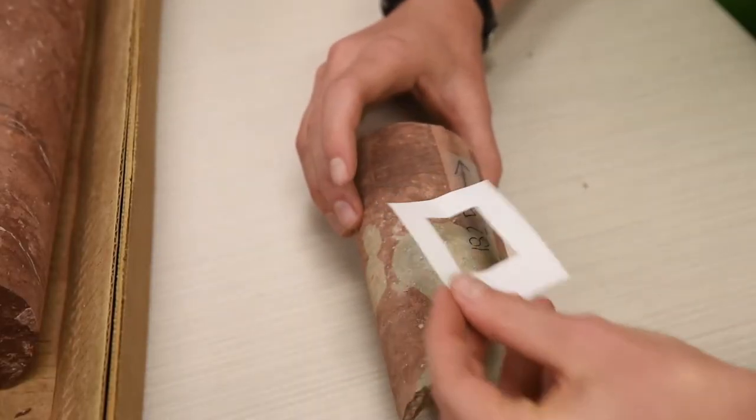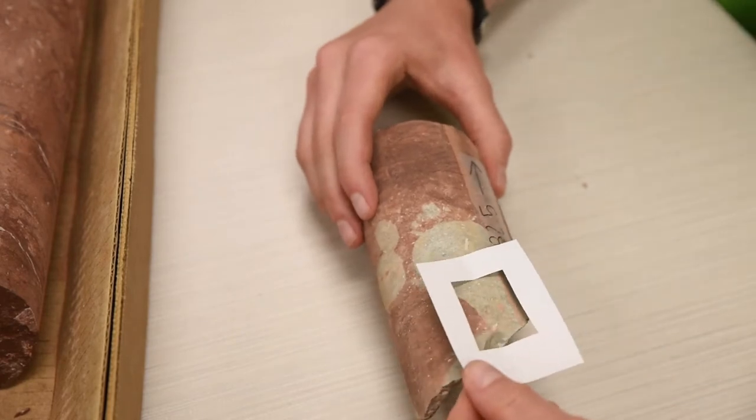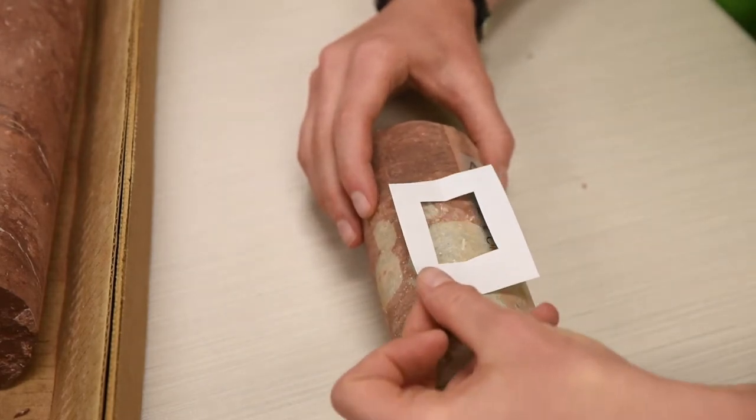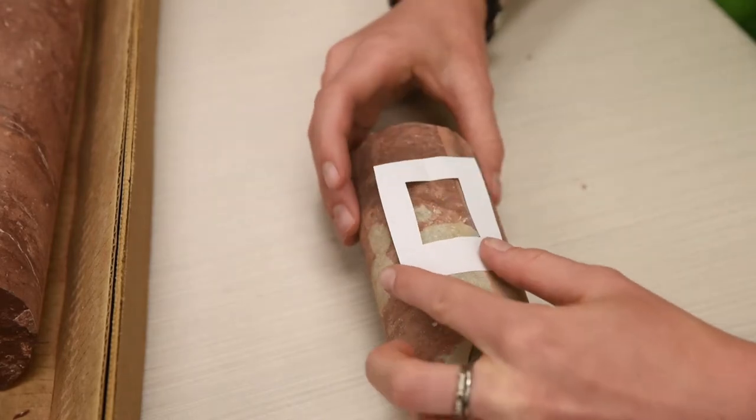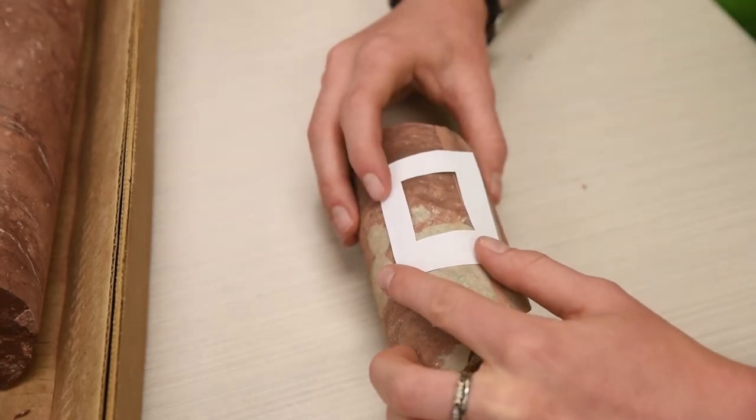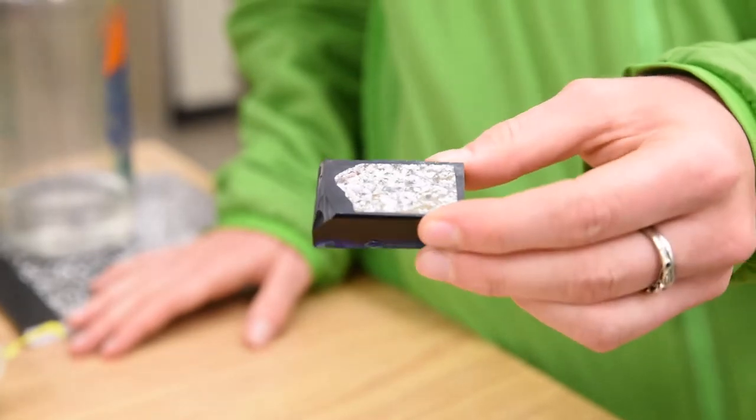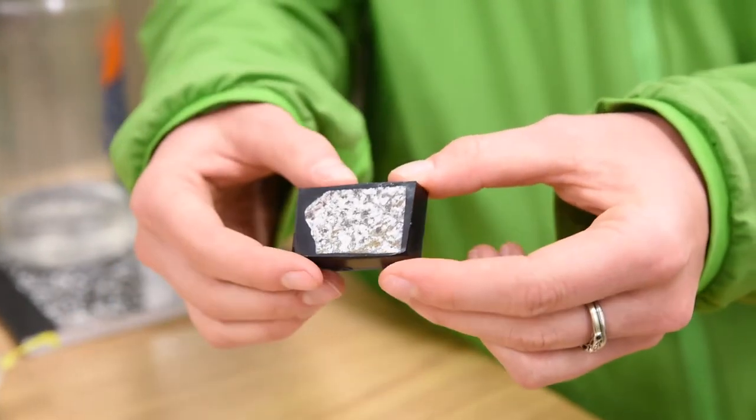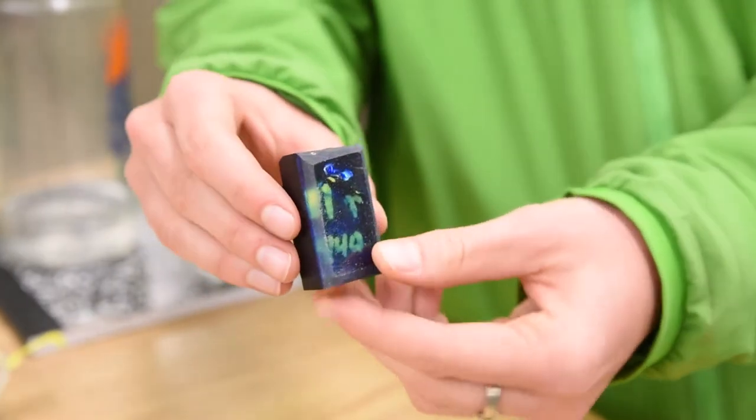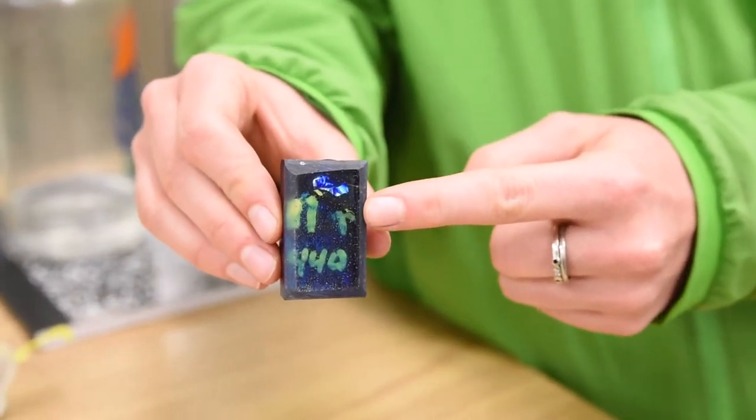We first choose where on the rock we want to take a closer look. In general, we target interesting structures, alteration features, or changes in rock type. Then, we cut the rock into what are called billets, which are smaller, evenly cut pieces of the rock that can be glued to the glass microscope slide.